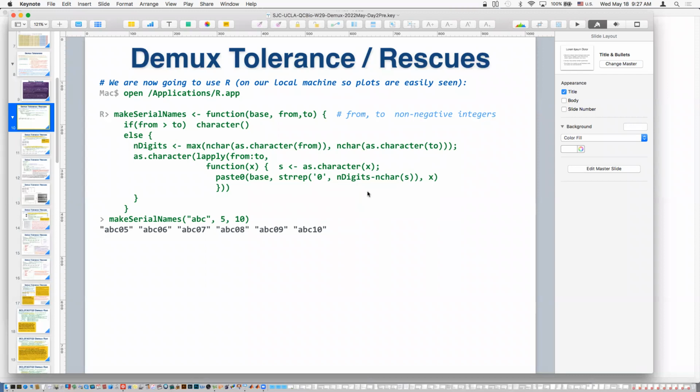But of course, how do you get higher recovery? It's generally by allowing more tolerance. What does more tolerance mean? It means you're taking sequences further away from the intended targets and putting them into files. Eventually, if you go far enough away, that's not going to be right. Intuitively, the higher the Demux tolerance, the more likely the mis-Demux will be higher. And mis-Demux is bad.